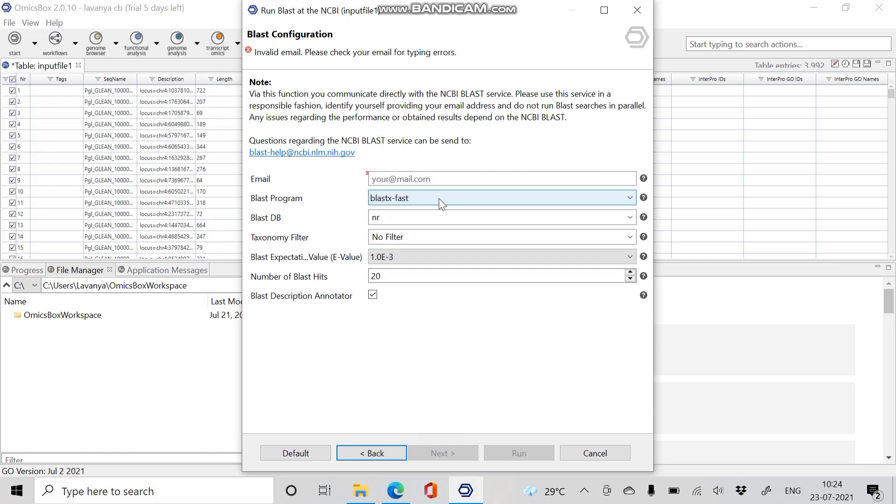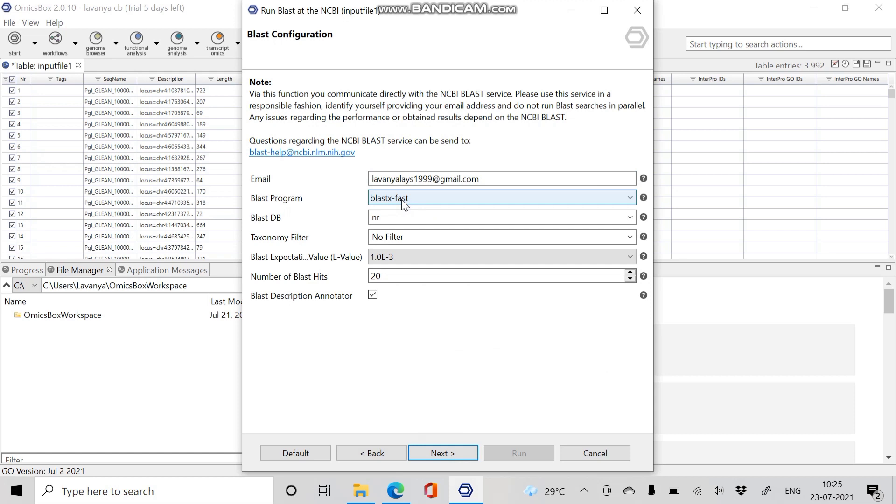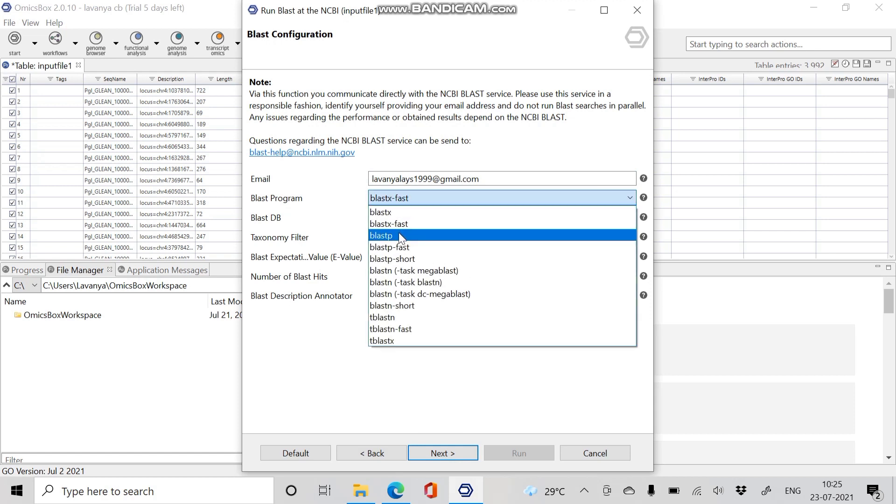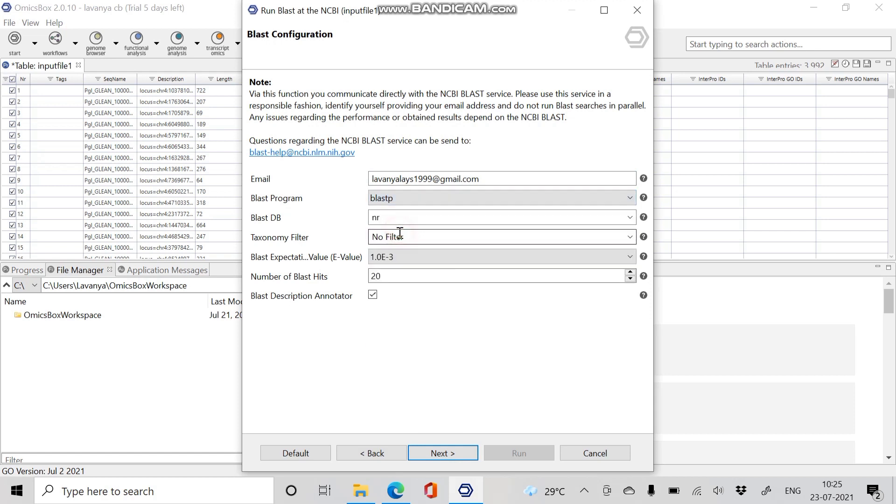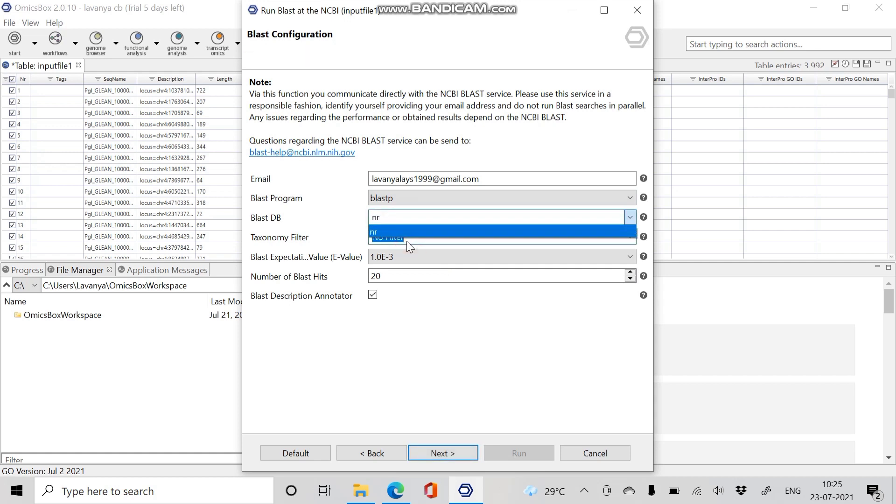In the BLAST configuration page, email address is needed in case of NCBI BLAST. Enter the email ID. In the BLAST configuration dialog, select the type of BLAST mode, the BLAST program which is appropriate for our sequence. Since our sequence is protein sequence, we are choosing BLASTP. Select the BLAST database as NR, non-redundant database. The taxonomic filter is a search for BLAST results only in the selected taxonomy. I am not giving any taxonomy.